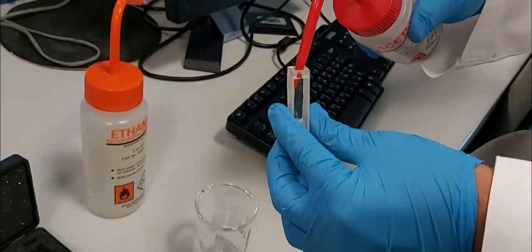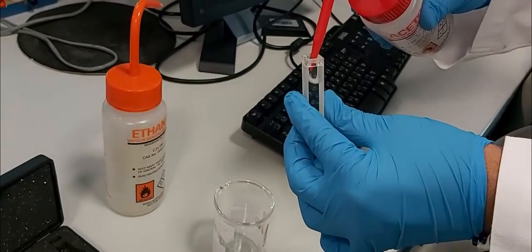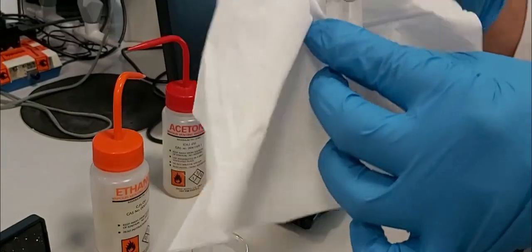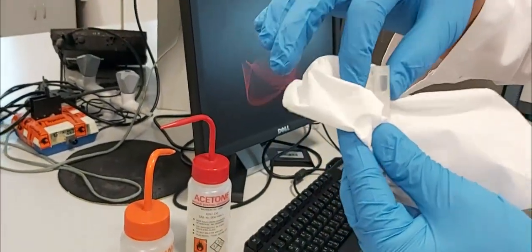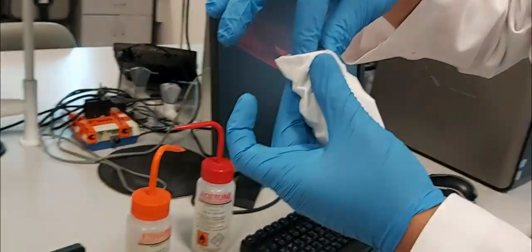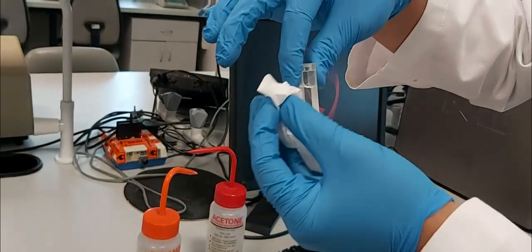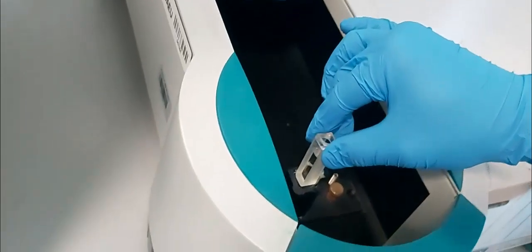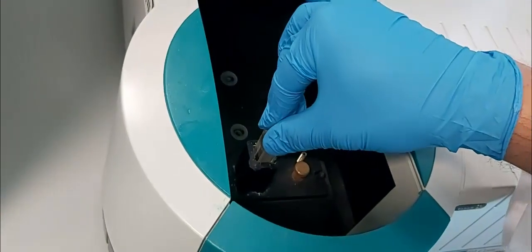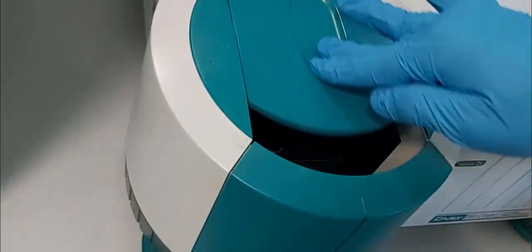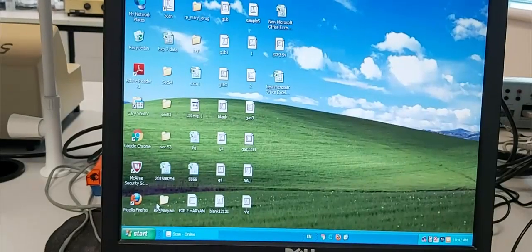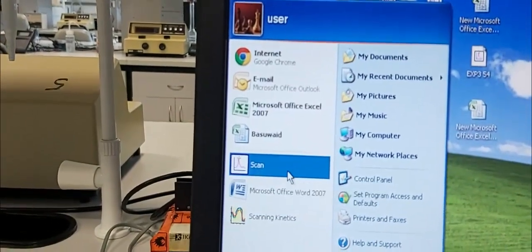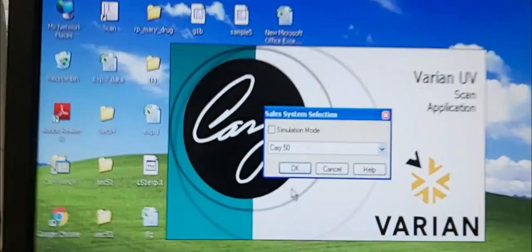Wash it two or three times as you want. Then we take a blank — we fill the cuvette with the solvent. Remember, in this video I recorded with acetone, but I used ethanol as the blank because later I will use a sample containing ethanol, even though I recorded the video here with acetone. So we go to the equipment software, we click on 'Scan'.